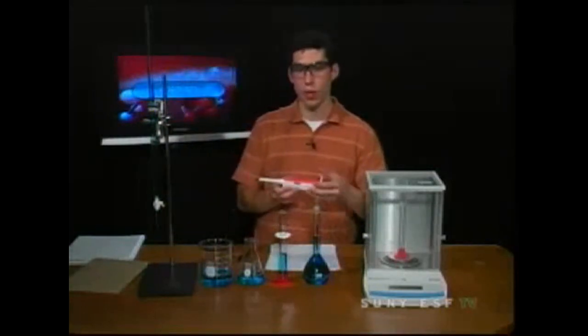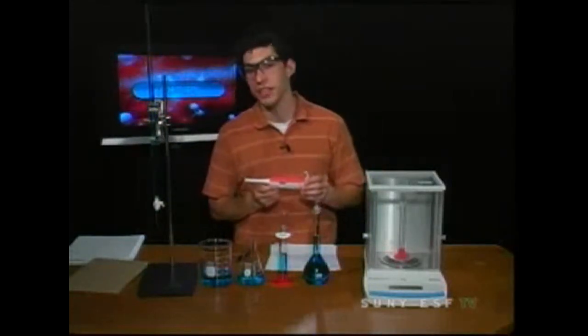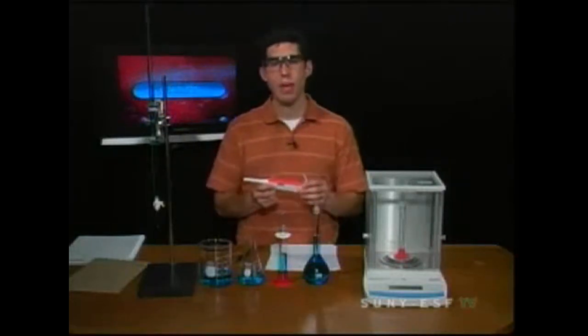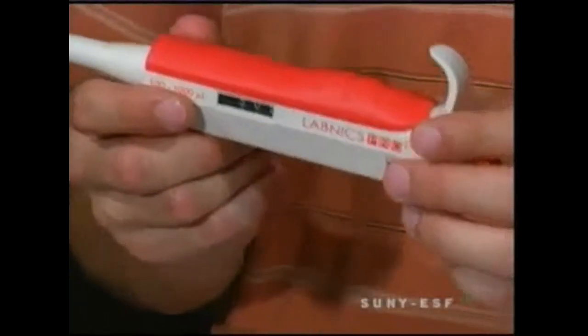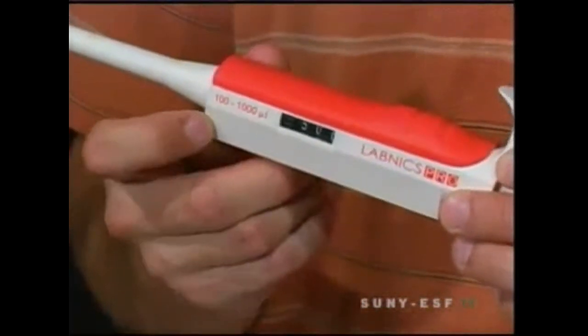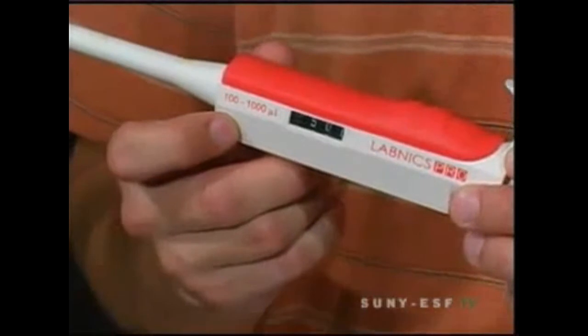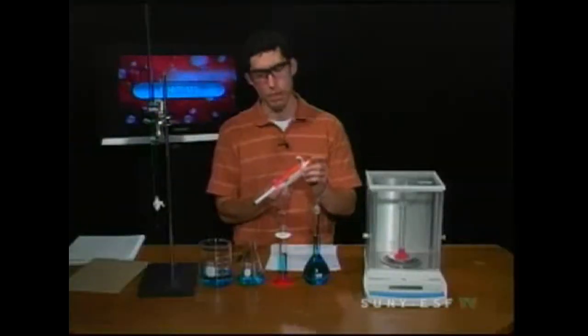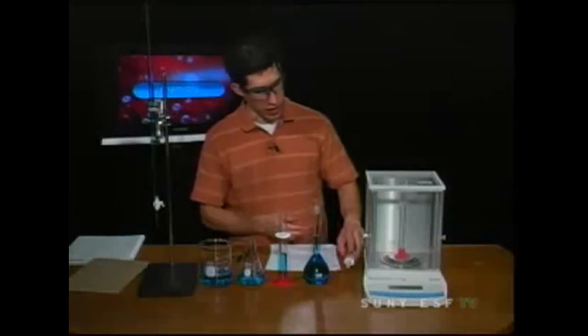One of the most accurate pieces of equipment, and you may see this in TV or in biology labs, is the micropipet. You may use this on and off in the lab. This is good to microliters. You can see that here - it's 1 to 1,000 microliters. So very, very accurate piece of equipment with a little plunge top on it. We'll talk about that more another time.